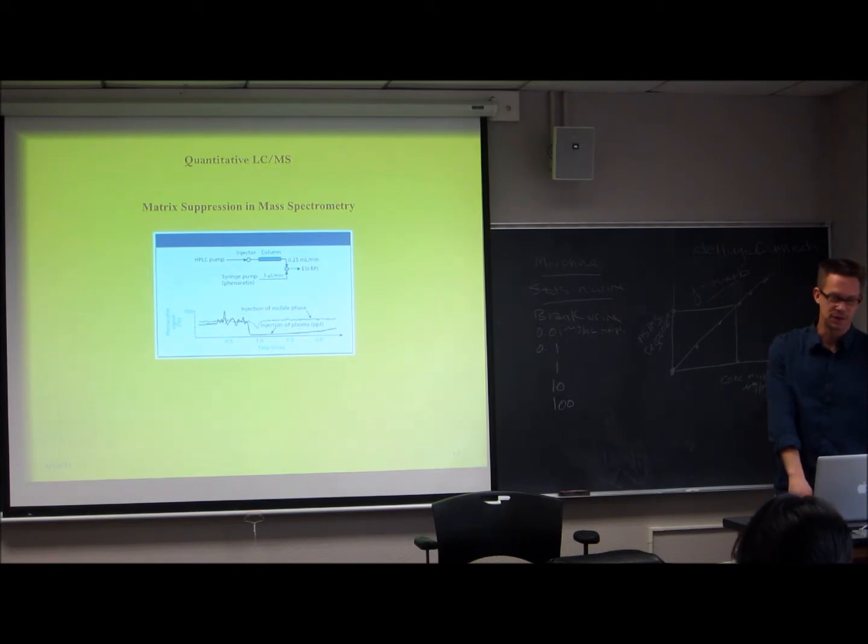So I've mentioned this a couple times in quick passing. We'll see if you were listening. But what do we do to overcome these limitations? Yep, internal standard.